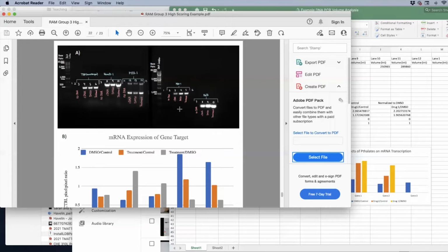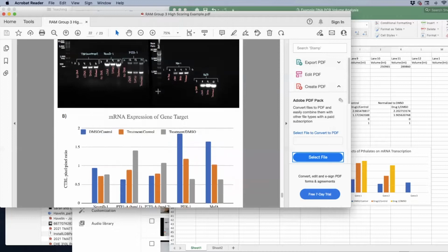Any questions about that from the 3 spectators? And it looks like, I don't know how to do this. It might be something you can do with a tablet. It kind of looks like they opened this image and edited it themselves, like with a stylus. You can also do this by throwing it right in a PowerPoint, and you can enter a text box over it, type these things up. You can do all this in PowerPoint. If you guys have seen some of the videos I've made with animations, it's how I would do it. Okay, so annotate your gels.